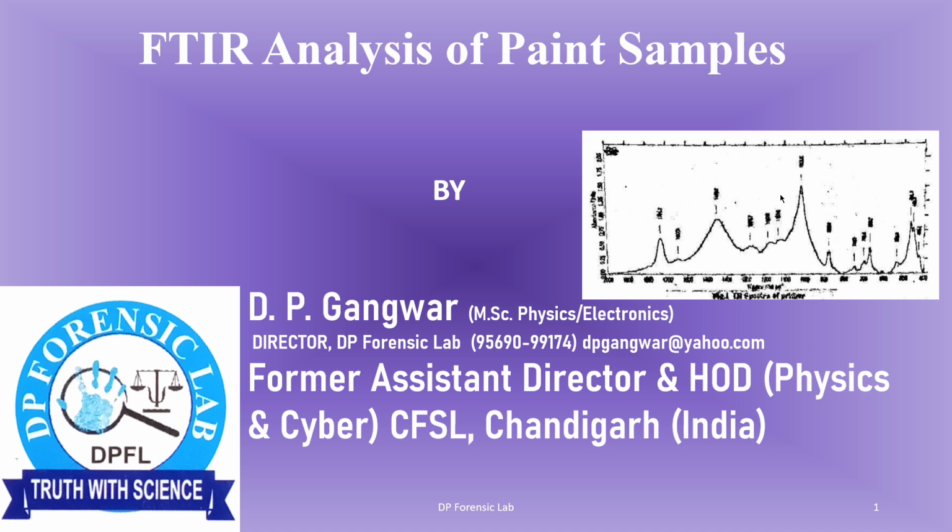In today's video, I will discuss FTIR analysis of paint samples. Paint samples frequently come to the laboratory for comparison purposes. There are various methods for comparison and analysis of paint samples. FTIR analysis is one of the best methods, because it is a very sensitive technique, a very accurate technique, and also almost non-destructive. So in today's video, I will discuss FTIR analysis of paint samples.